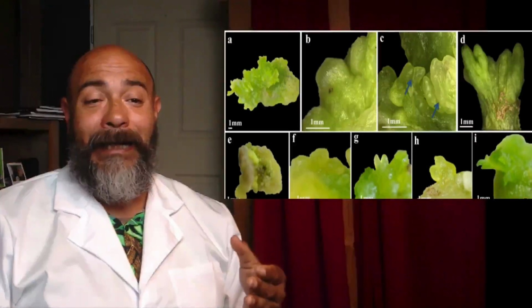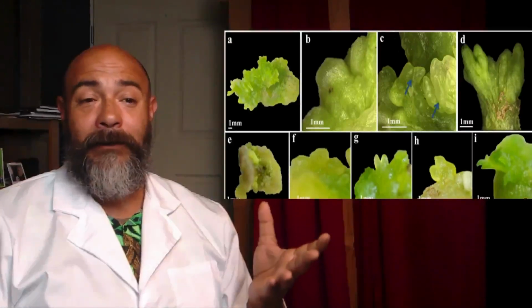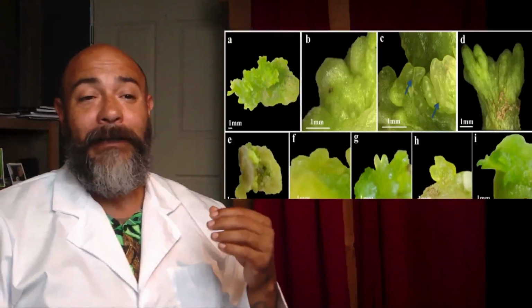By the time you get to I, you are there at your cotyledon, or your little plantlet phase, where it's actually growing a small plantlet off of that globular material.